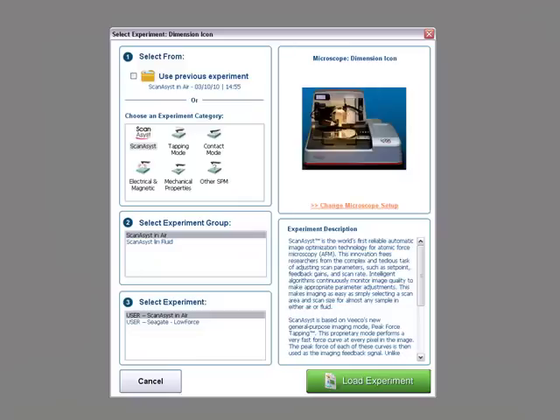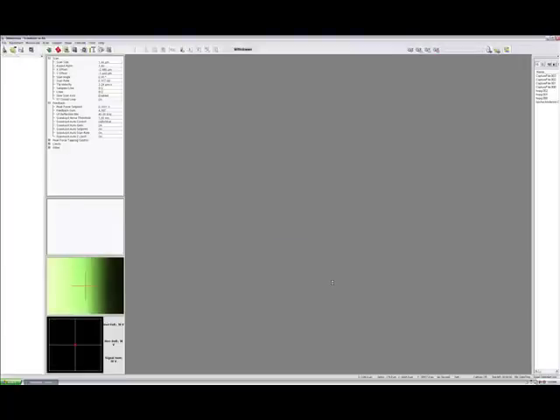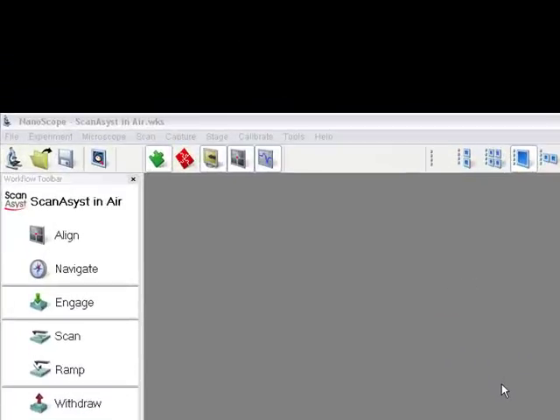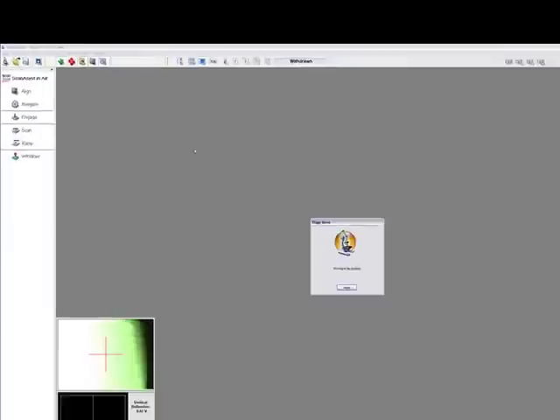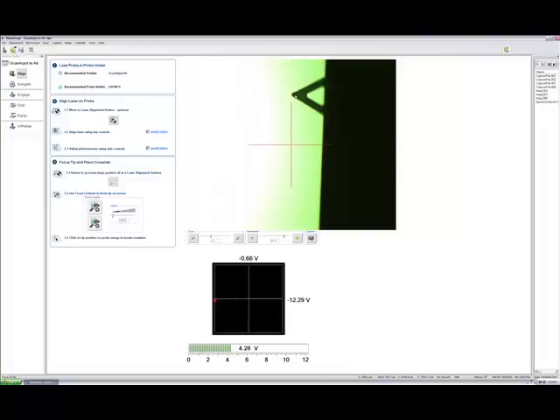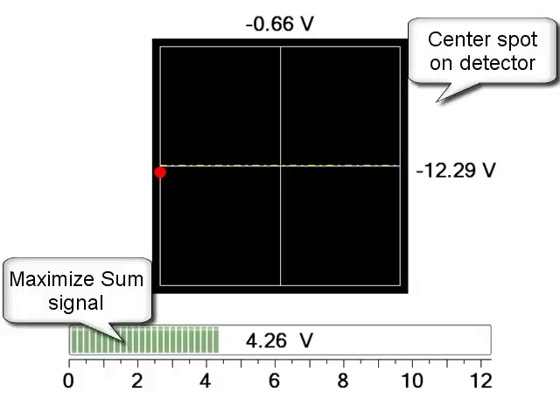Now let's start our little experiment. We are going to click on the NanoScope icon. The software will start and the new thing you are going to see is the experiment selector. We are going to select ScanAssist and ScanAssist in air. The system will now initialize itself and then come up with the experiment selected. The first thing we want to do is align a probe. For ScanAssist in air, we recommend using the ScanAssist in air probes — it is only one probe for every experiment.